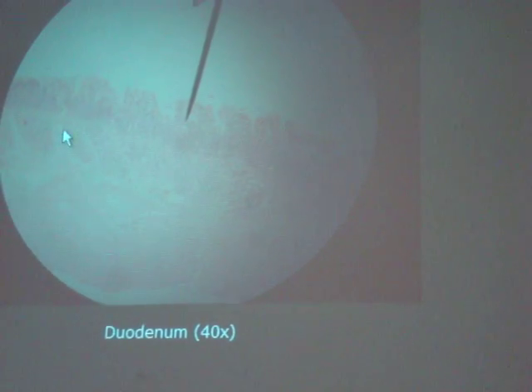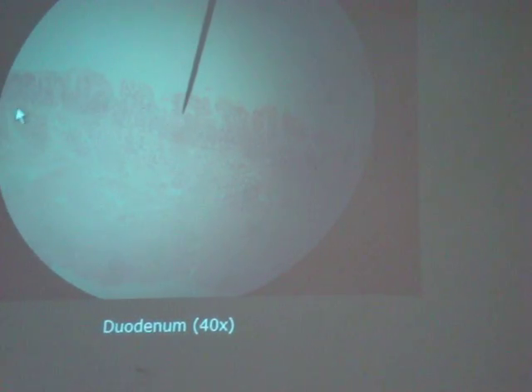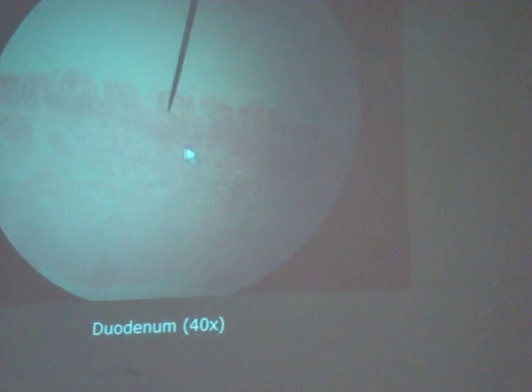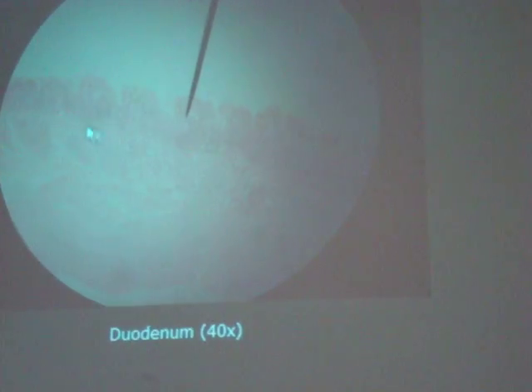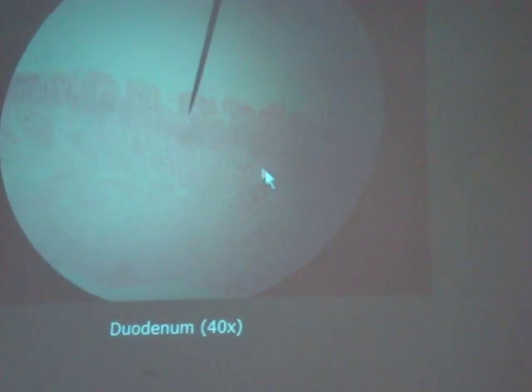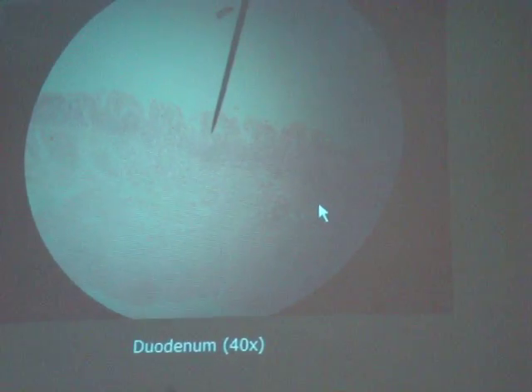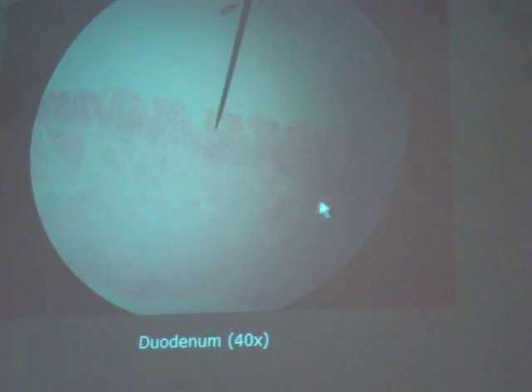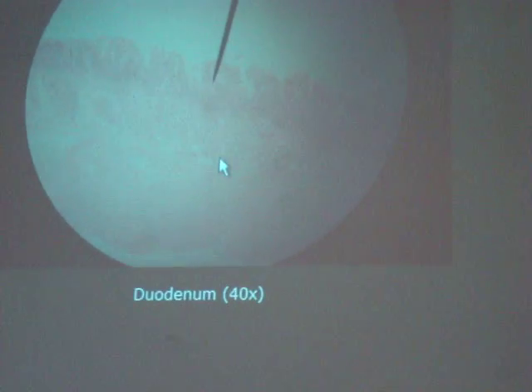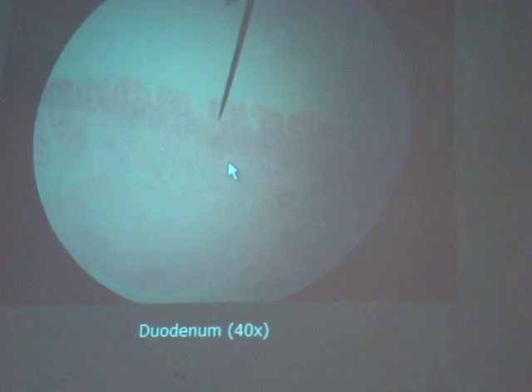Okay, and then if you can see how it's really dark purple right there, it transitions into this long, thin muscle layer. So that's the muscularis mucosa. Okay, so everybody see how it runs from here? It keeps going and kind of comes down a little bit. Everybody see that? Yes. Okay. It's pretty easy to see. Submucosa is going to be from the muscle down to about there. Okay. So this is submucosa between these two.